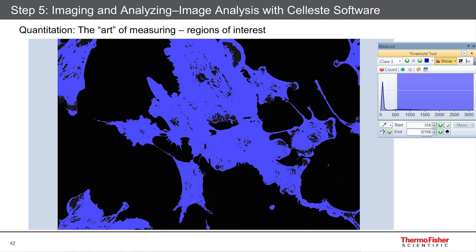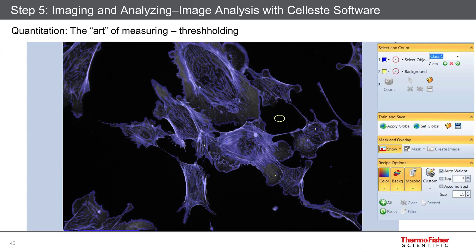One interesting feature about Celeste is that it has a smart thresholding method. You can actually teach the system what's specific and what's not. So in the pale blue here, you can see the actin is very nicely selected and none of the background — that's a neat feature of Celeste. I won't go into all the features of Celeste software here, but I urge you to learn more at our website. There's a lot of great functionality in that software package, including 3D reconstruction, various segmentation techniques, and counting — so if you want to count cells in an automated fashion.